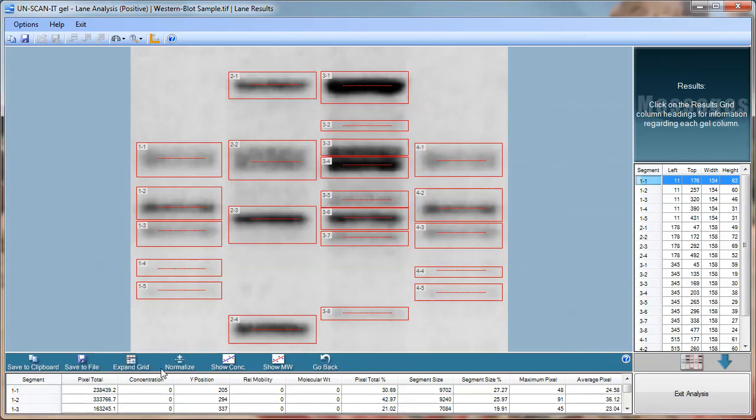You can also use the results spreadsheet to create a concentration calibration curve or molecular weight calibration curve using the values from a standard discussed in another video on the Silk Scientific channel.